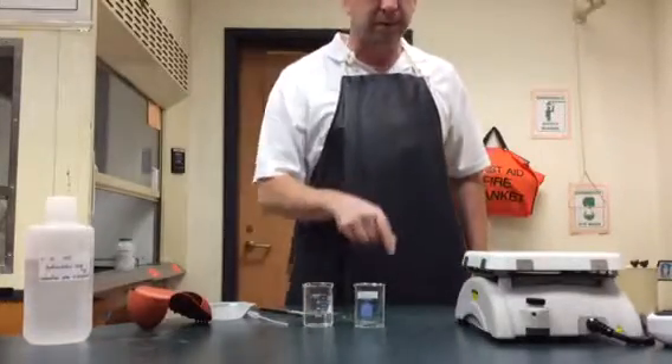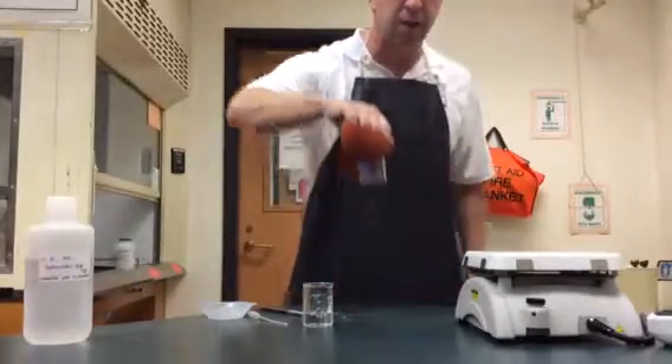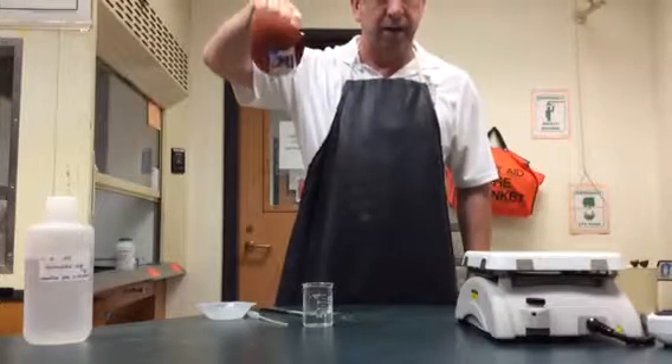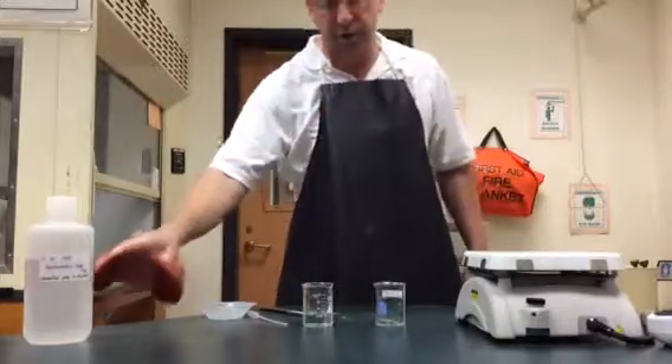We've weighed our magnesium and we've weighed our beaker. Sometimes I'll also double check to make sure that everything is correct — that when I weigh the magnesium and the beaker together, it equals the weight of the magnesium by itself and the weight of the beaker by itself added together. Double and triple check.